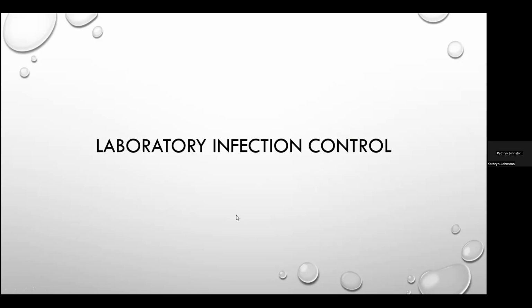So laboratory infection control practices have traditionally been included as part of a lab safety program for years. And so what we're looking at in doing this is we know the principal routes of laboratory transmission. They did surveys in the US between 78 and 86, and there were reported annual incidences of 3 to 3.5 infections per 1,000 employees per year. The present incidence of laboratory acquired infections, which are a healthcare associated infection in the laboratory, is unknown.